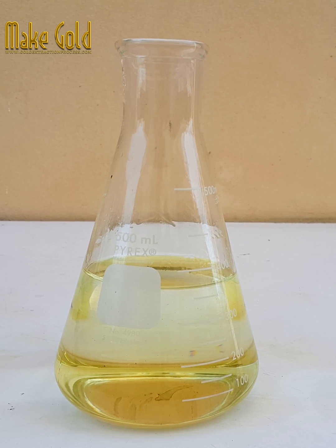Please note that Aqua Regia is a hazardous substance and should be handled with extreme caution. Proper safety precautions and protective equipment should be used when making or using Aqua Regia.